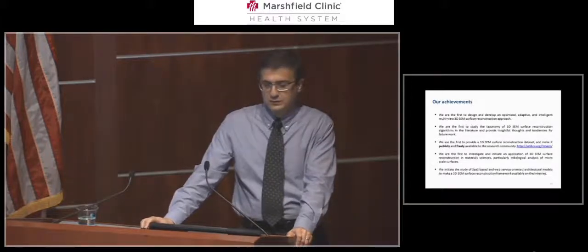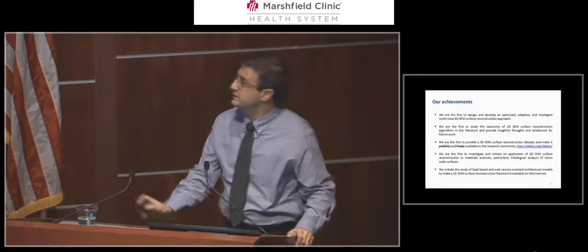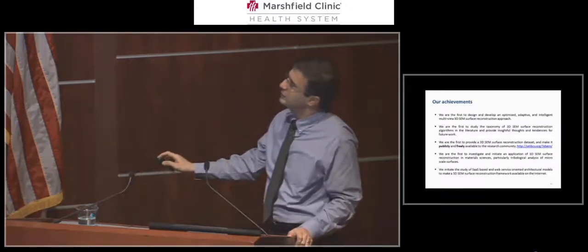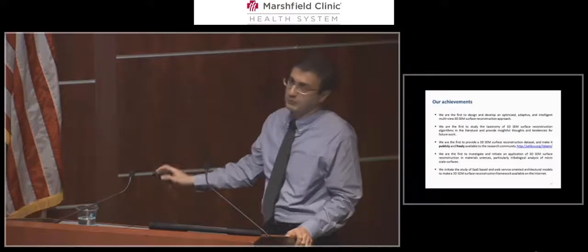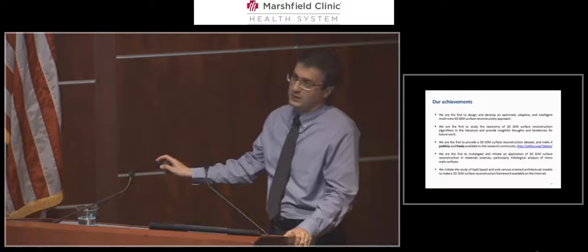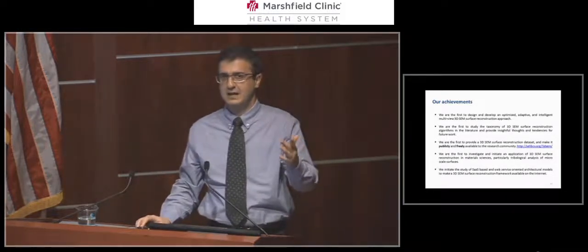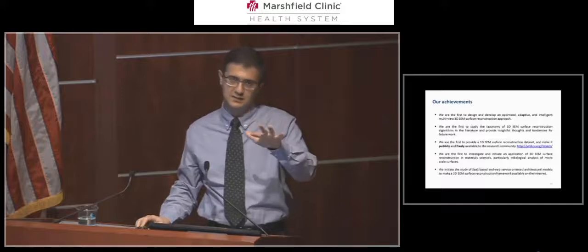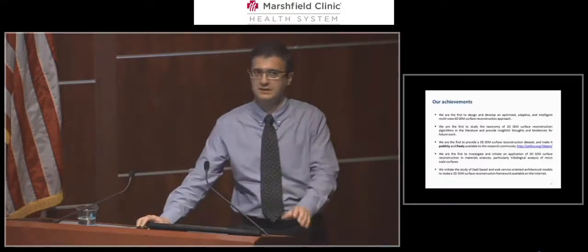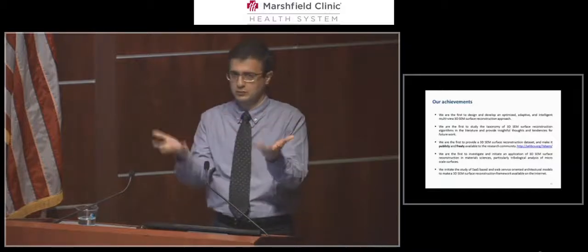We are the first to investigate and initiate the application of 3D SEM surface reconstruction, particularly in tribological analysis of microscale surfaces. Using such a framework, we are able to measure flatness, waviness, and roughness of 3D surface models. I mean, we are not just able to see the 3D visualization.